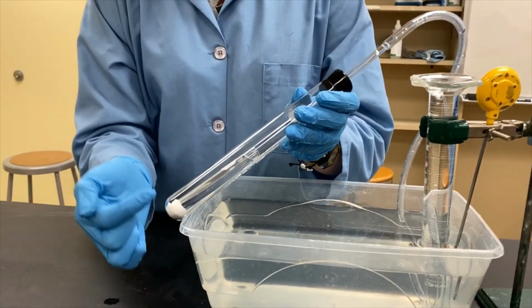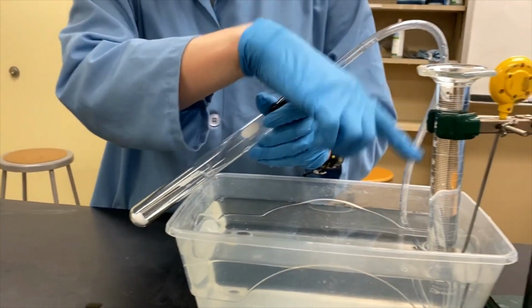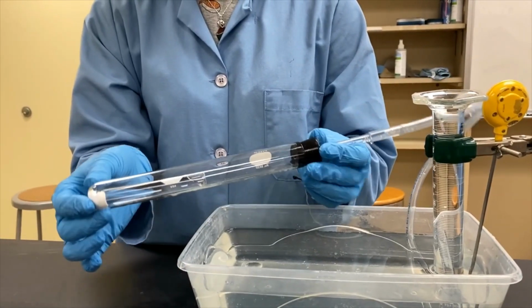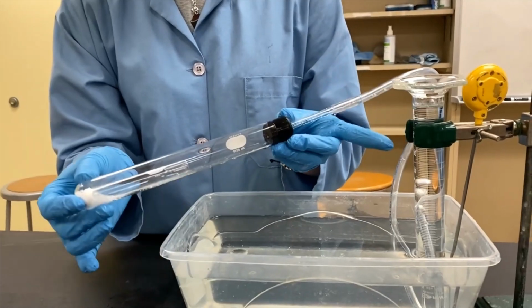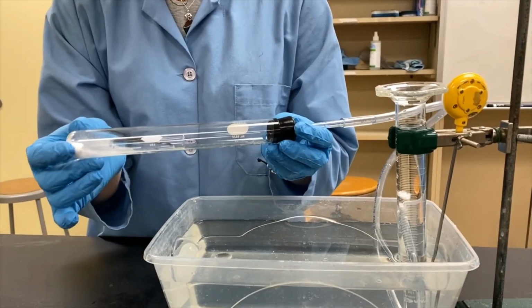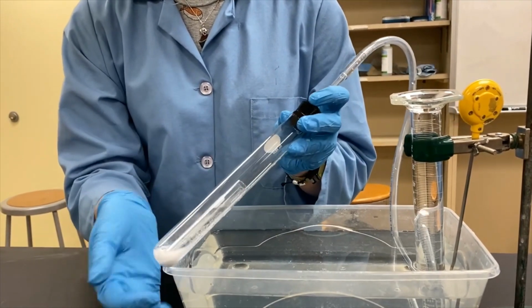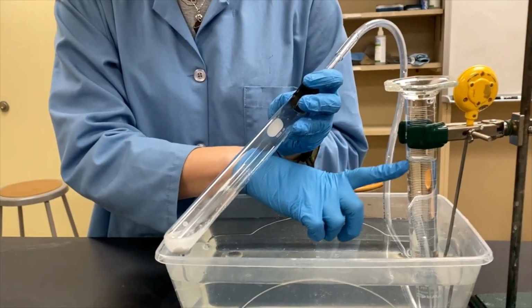So you see the calcium carbonate down here, our acid is in here, and we see that there's no air in this graduated cylinder. What I'm going to start to do is tilt, and we will immediately see a reaction created. So look for the clues, what we've talked about previously, about when you can tell a reaction is occurring. So in this case, we see the creation of a gas, so we're seeing bubbling pretty much everywhere. If you look down at our CaCO3, you can see the bubbles created here, and you can also see the gas being produced here.